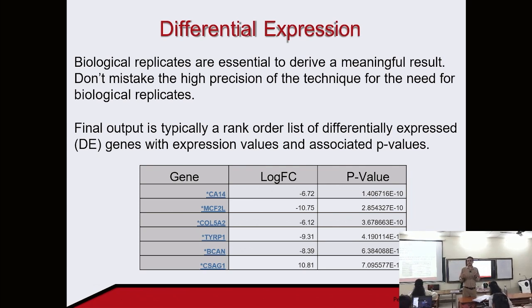So you would want to elaborate further that fold change is a ratio of normalized counts from condition and normalized counts from control. Sorry, normalized count from case or condition, and normalized count of control. Okay, so yeah, case is condition actually. So okay, good. So clear? Yes. And before we compute fold change, why would we want to obtain the normalized counts?